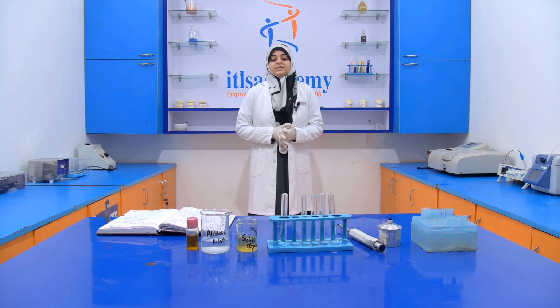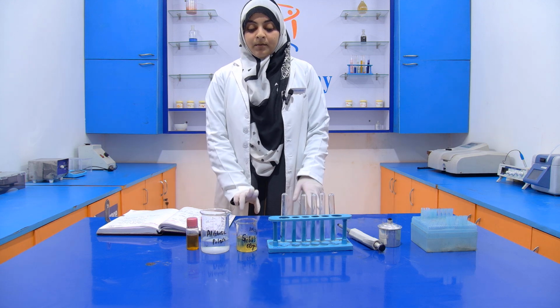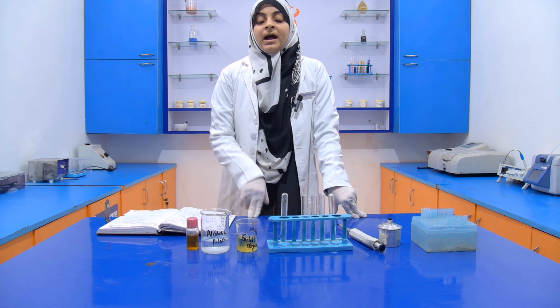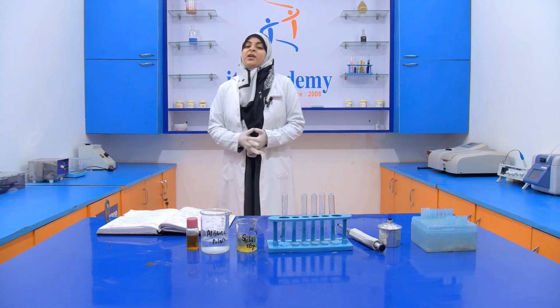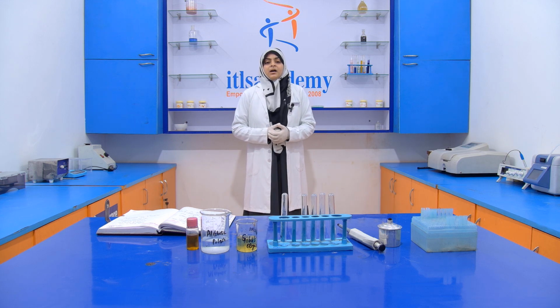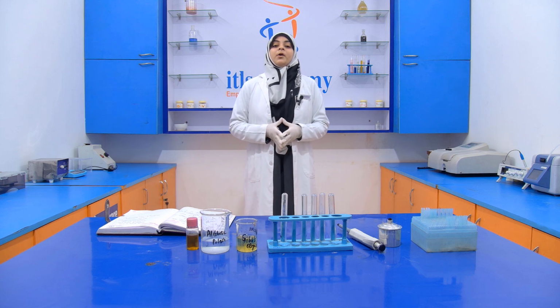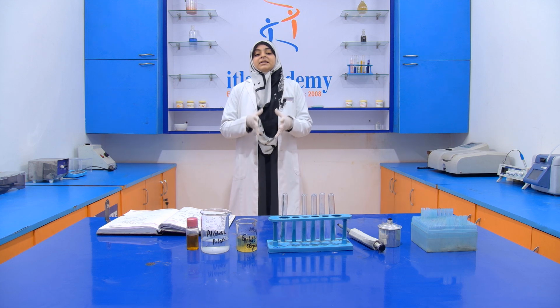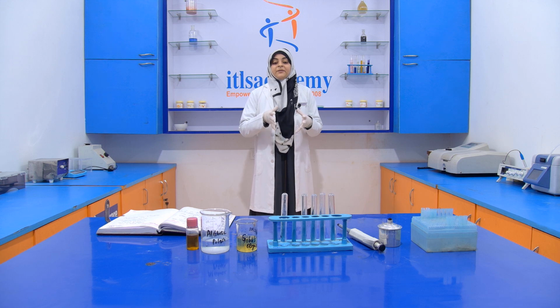Now, for performing this experiment, we require this setup. Before introducing this setup, I have to tell you why this mobile oil is added into the edible oil. Obviously, for a greasing purpose, for enhancement of the quantity of the product, and for enhancement of the color of that product. But this mobile oil has an adverse health effect. That's why it comes under the category of adulterant.